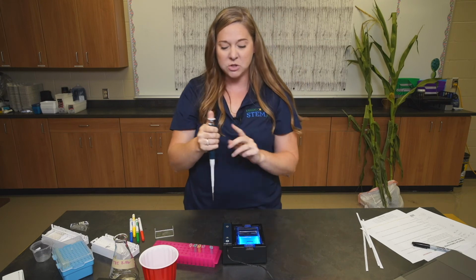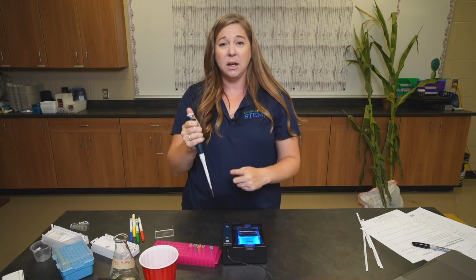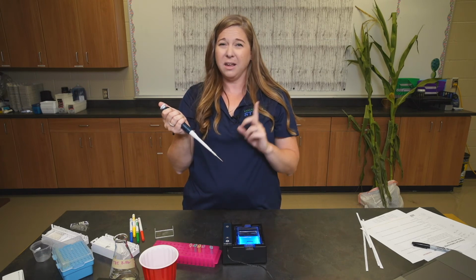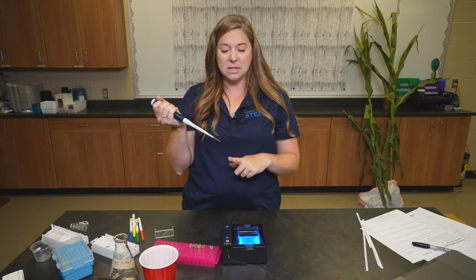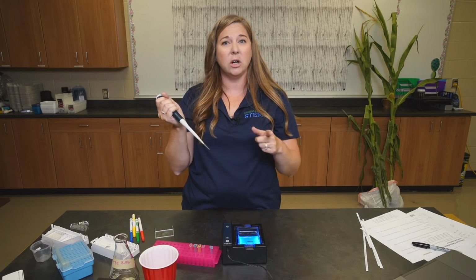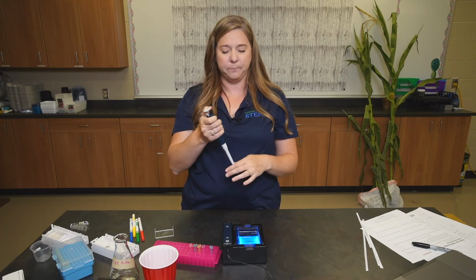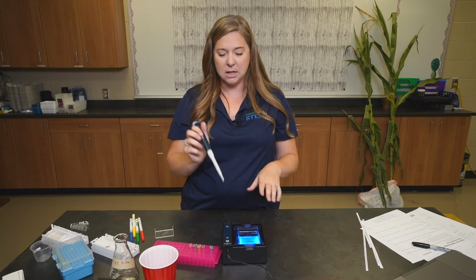If I release the plunger while it's still underneath the level of the liquid, it's going to suck all of that liquid back up into the micropipette tip. That's a no-no. So make sure when your students are done loading the sample, there should be nothing left in this tip. If there is, encourage them to do it again and make sure they hold that down in the same well. From here, I can go ahead and release this and load the rest of the 5 samples.